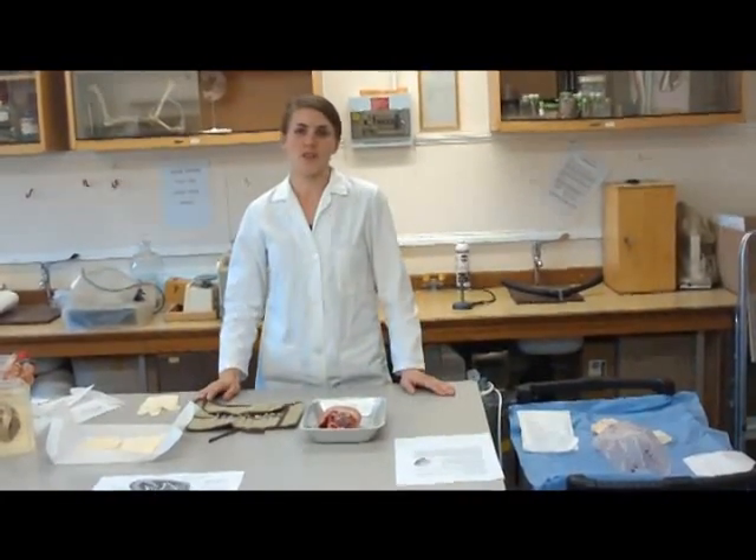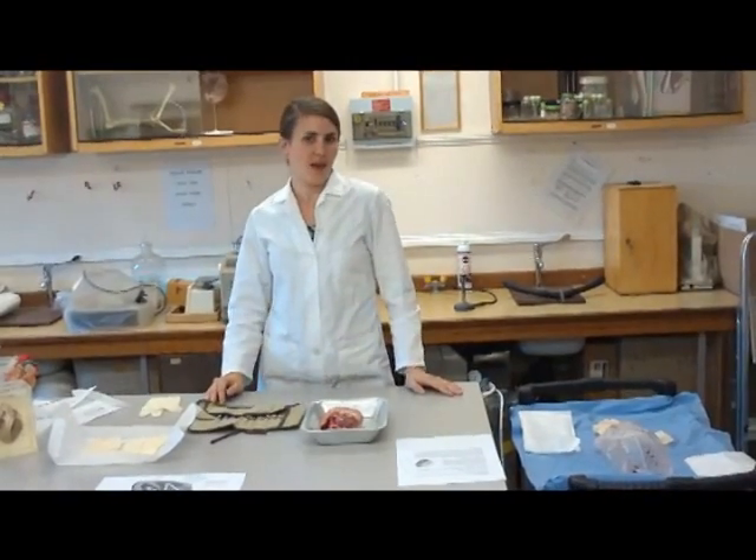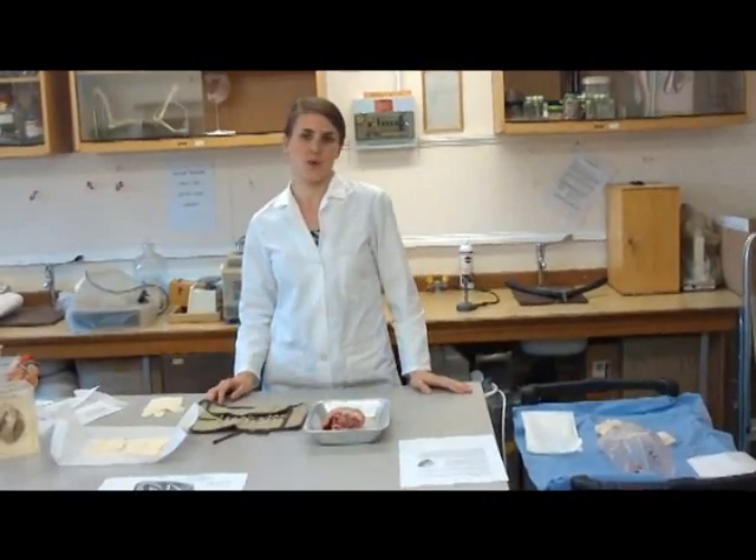In terms of equipment that we need to make sure we're protected: a lab coat, gloves on, and making sure that hair is tied back, no earrings and no jewellery.